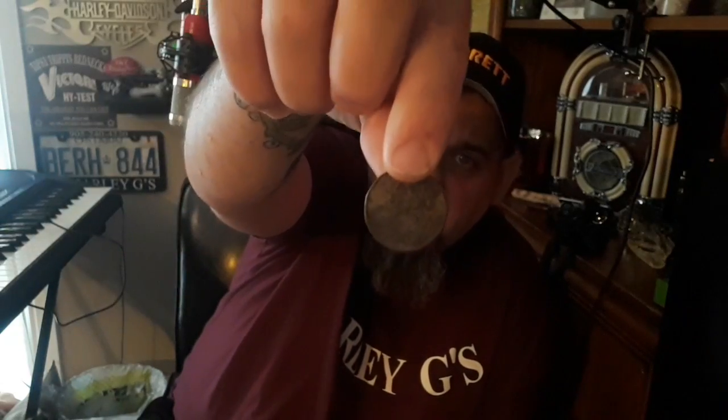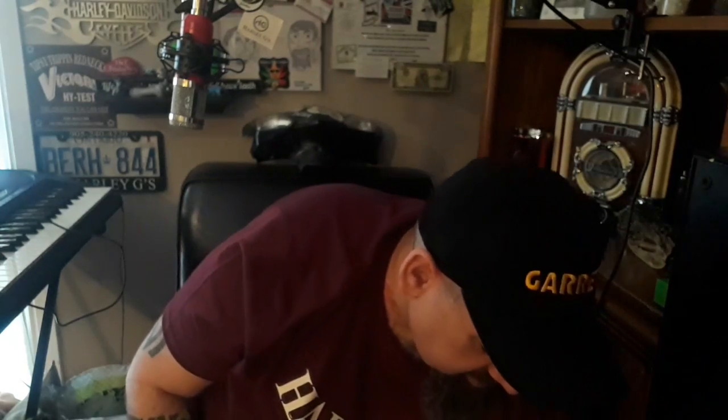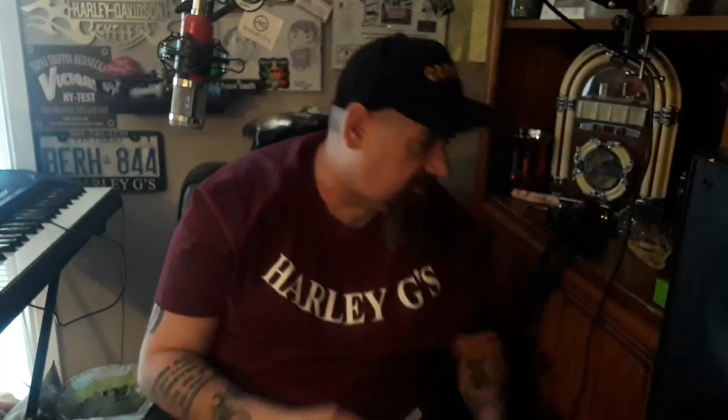Oh, jewelry and stamps — another reason I got it, actually. I've got this loony that I found metal detecting with the Garrett metal detector. Could always zoom up on that to check the date one day. I think this is kind of cool — I'm pretty impressed with it. Check different shaders out just to see. I like it, I'm impressed. For 20 some odd dollars I am quite happy — it comes with everything you need.